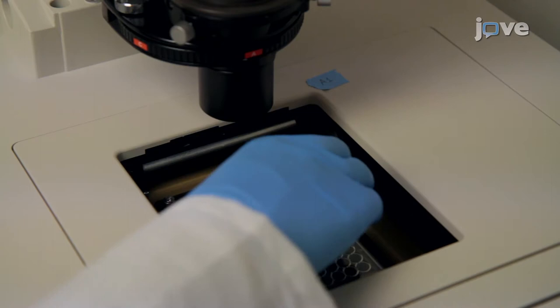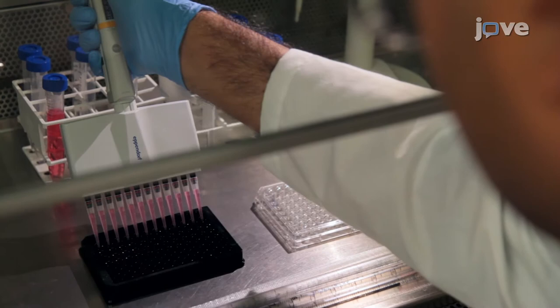At the end of the experiment, remove the 96-well plate from the HCS system. Under sterile conditions, collect conditioned medium samples from each well and transfer them to a fresh 96-well plate. These samples can later be used for an ELISA.